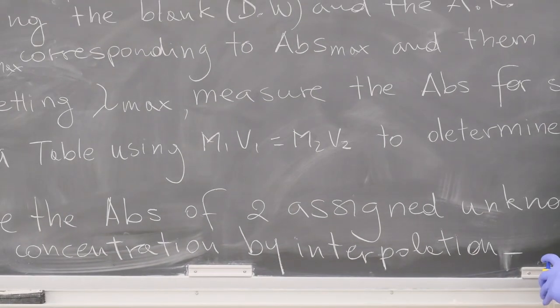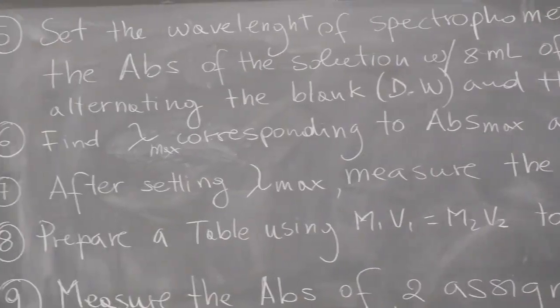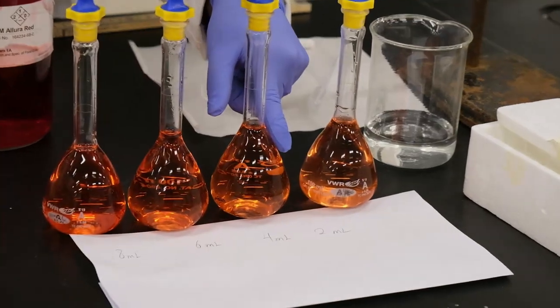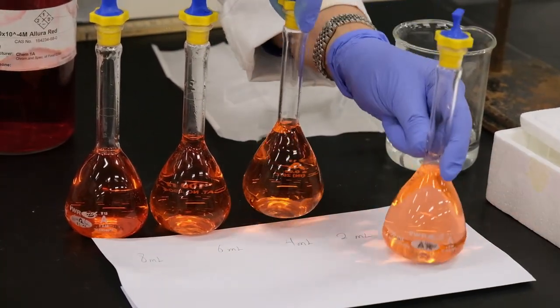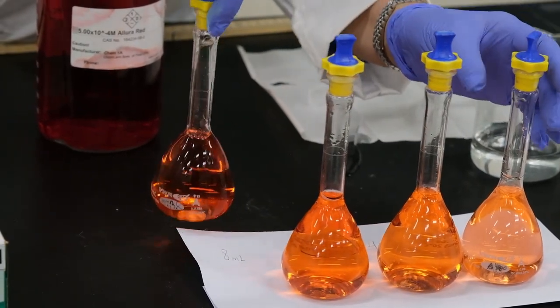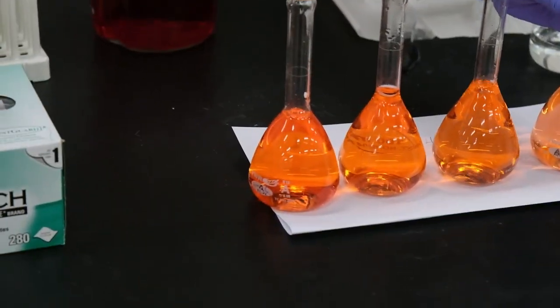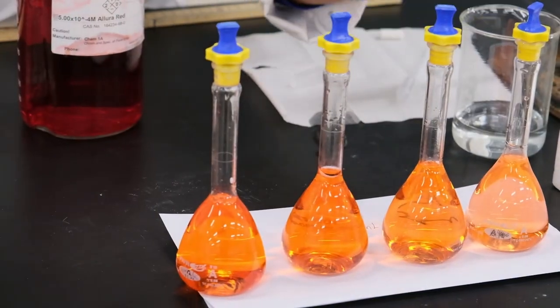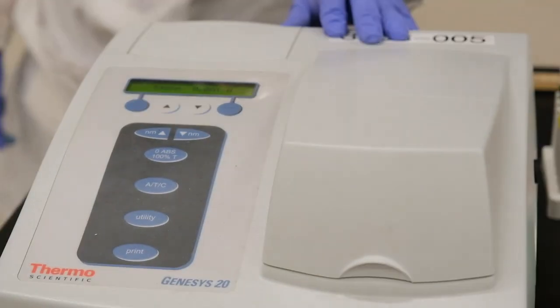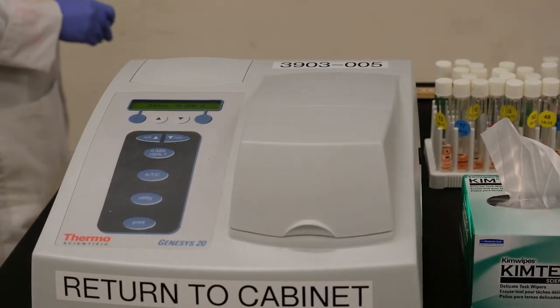Once you obtain the four solutions, and here are the solutions, the one with 8 milliliters, 6, 4, and 2. So you see that they have a different color. The color becomes more intense as you go from one solution to the other one, okay? You're going to use the spectrophotometer to prepare your calibration curve. So let's see how we are going to do that.